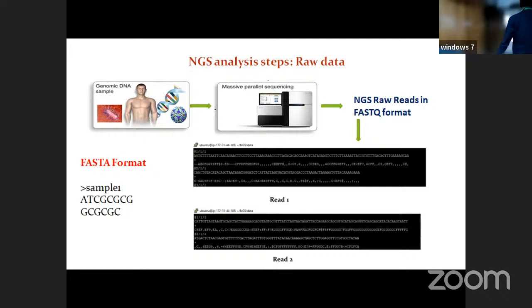So basically, the last line you are seeing here, that is dash dash AA. You can see the last line. I would rather show with the mouse. You can see here, this is A. First position is A. Then there is a plus symbol. Then there is a dash. Now you must be wondering what is this dash? I was talking about 90%, 95%, 99.9%. What is the dash? This dash is nothing but an ASCII symbol.